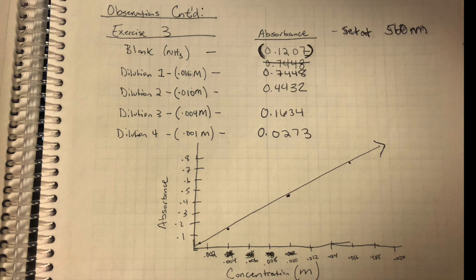Finally, we plotted a graph to show that the concentration is directly proportional to the absorbance in a linear, positive fashion, and thus it satisfies the Beer-Lambert law.